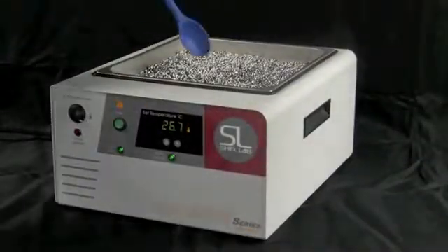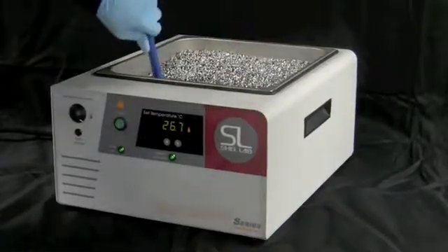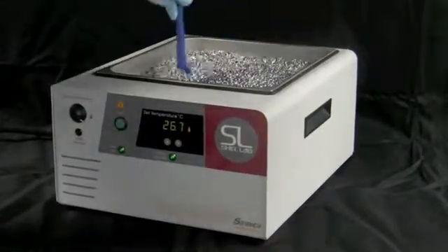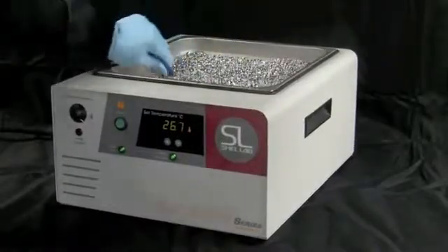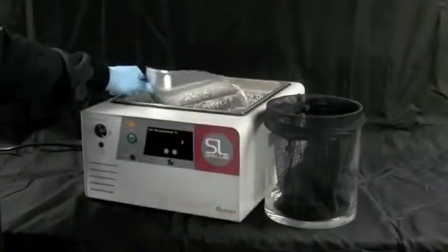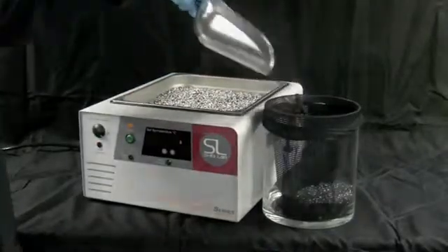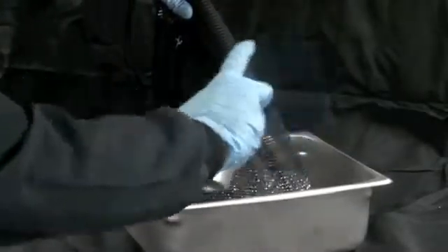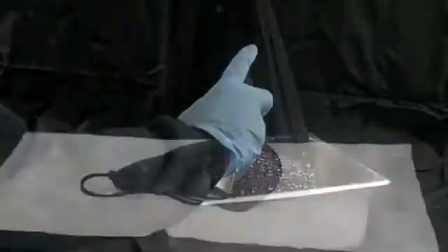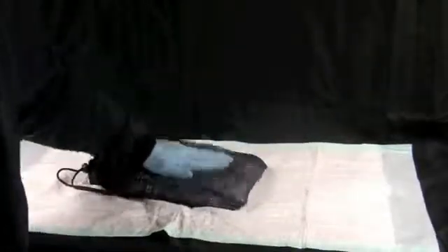Bead baths require minimal cleaning and don't need to be regularly monitored, emptied, or refilled. A spray application of 70% ethanol, stirred in every few weeks, is sufficient. If something is spilled in the bead bath, simply scoop out the beads, wash with a mild dish detergent and clean water, spray with 70% ethanol, then use an absorbent pad or paper towels to thoroughly dry the beads. Never return wet beads to the bath.